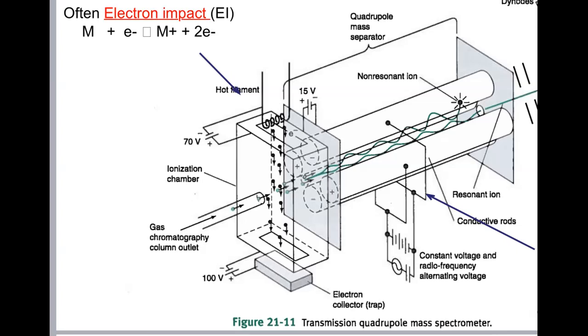So what do we do with this electron flow from top to bottom? Well, we put the outlet of our capillary tube somewhere in the region where, if molecules get eluted from the tube, they basically interact with this flow of electrons. And ultimately what happens is this up here. One of our analyte molecules, abbreviated by M, may collide or impact with one of these high-speed electrons that are flowing through this source. If that happens, a cool thing occurs. We ionize our molecule M, and in that process we strip it of an electron. So we're always making M+ ions. That's the molecule minus an electron.